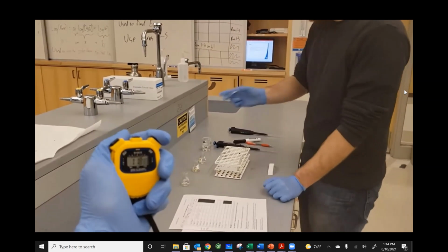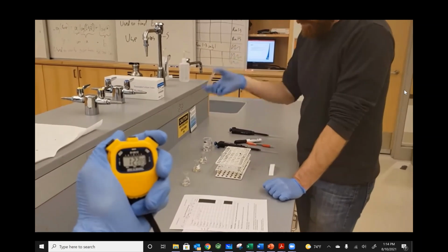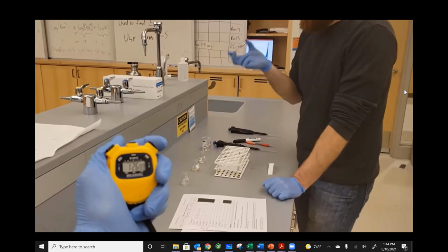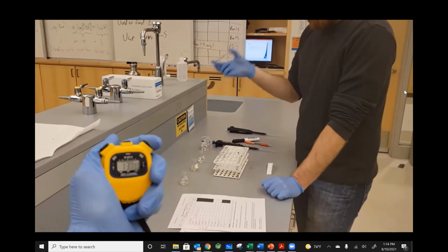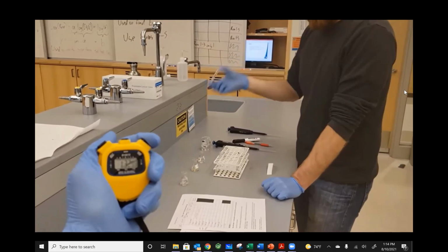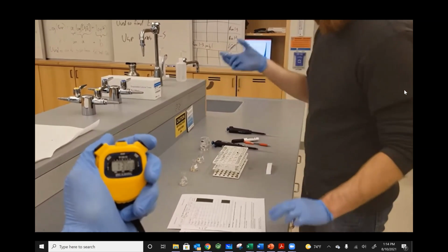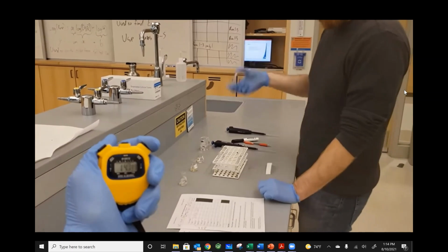Good news is that the other two should happen faster because we'll have a higher concentration of hydrogen peroxide.